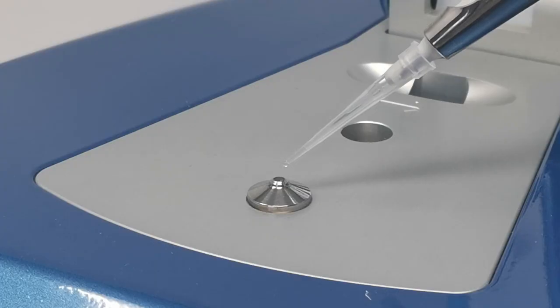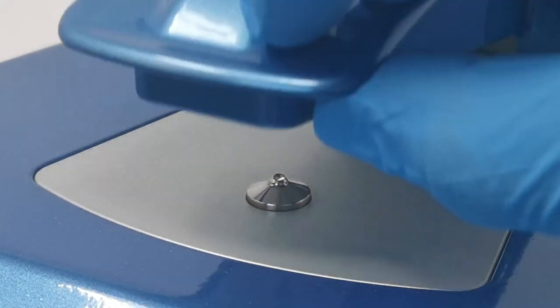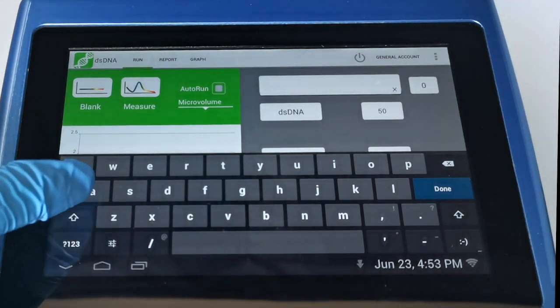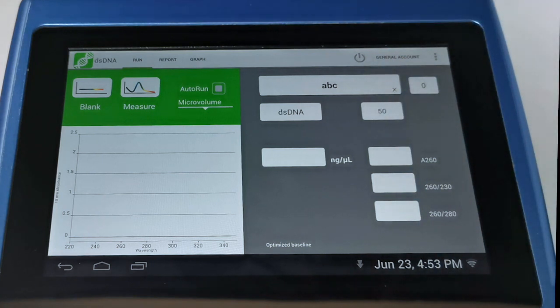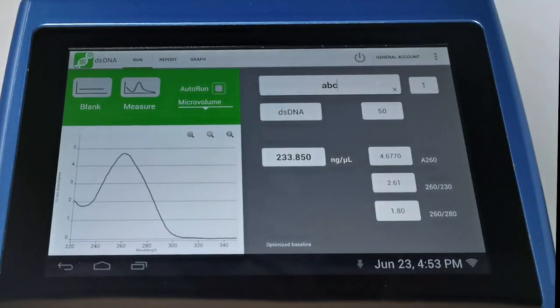We take a one microlitre aliquot and put it onto the lower measurement surface, then move the arm down. At this stage we have the option to enter a sample name via keypad, scan in a barcode, or leave it to enter sample names later. We can also select from the user accounts we've set up and then hit measure. While the data is being captured in a couple of seconds, it's worth explaining how the DS11 series captures data differently to other microvolume spectrophotometers.